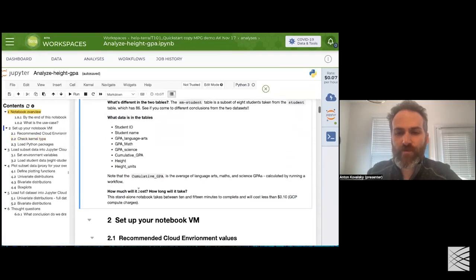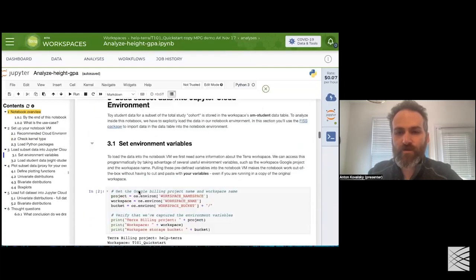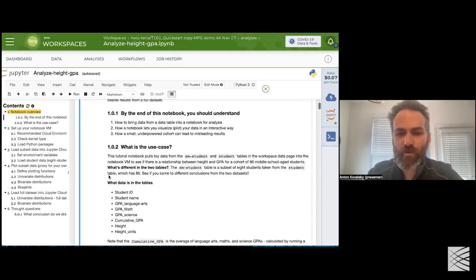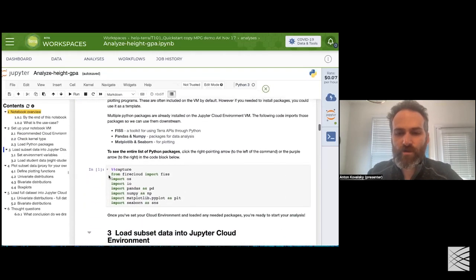And I'm going to ask everyone to do that because we have outputs already created here, and we actually want to watch them get generated. So we're going to clear all of our outputs.